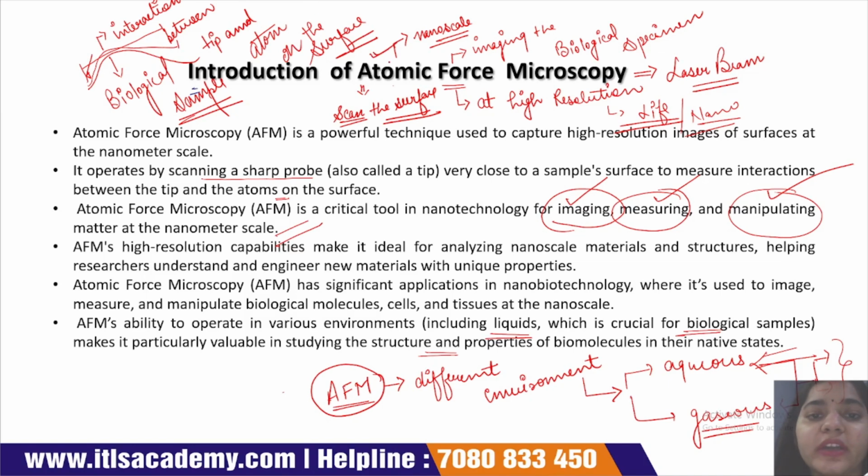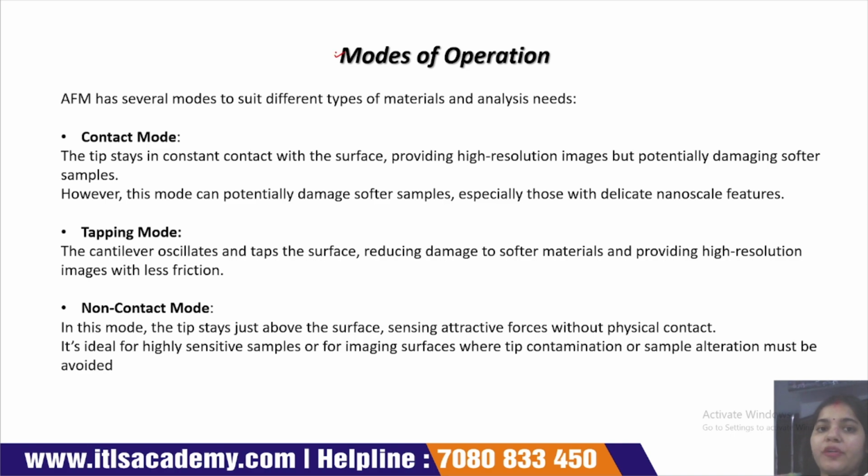That's why this atomic force microscopy plays a most important role in the field of life science as well as in nanobiotechnology.